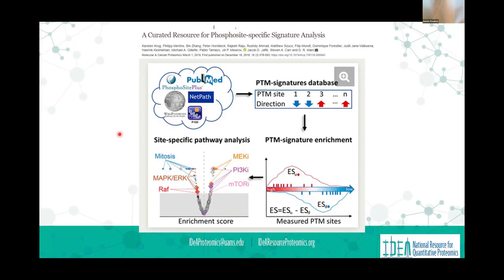And so a lot of the pathway analysis software may have a phosphorylation, but it may not mean what you think it means. There may be one protein that has multiple phosphorylation sites. And even if phosphorylation is up on that protein, maybe one site where the phosphorylation up increases activity, and maybe another site where if that's phosphorylated, it decreases the protein activity.